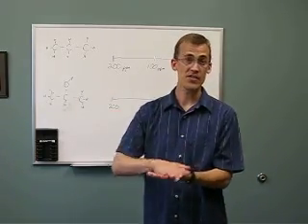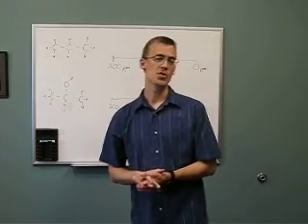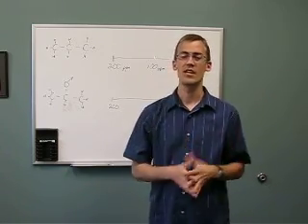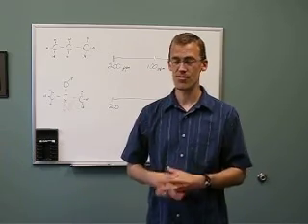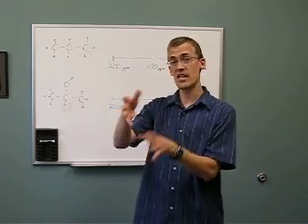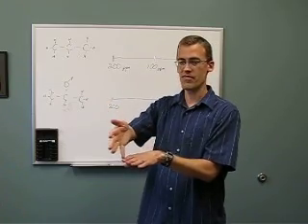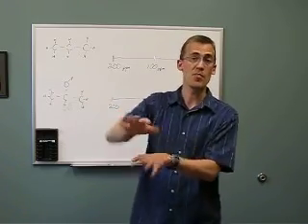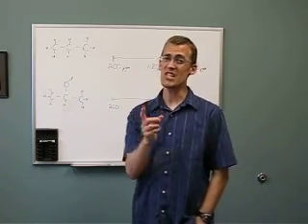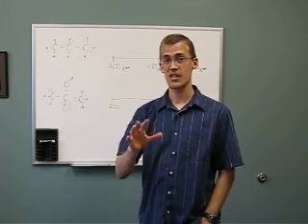Now, since you have ground state and excited state, there's a difference in energy, there's absorption, there's also emission. And most of the modern NMRs, and ours, an FT NMR, FT standing for Fourier transform, really function as an emission instrument. So we use a pulse of radio frequency to cause all of the nuclei to be in the excited state, so they're opposite the magnetic field. Then you pull it away, it turns off, and all these nuclei flip back. And when they flip back, they emit radio frequency, but that radio frequency is unique to that type of nucleus in that environment. So we get this spectrum.